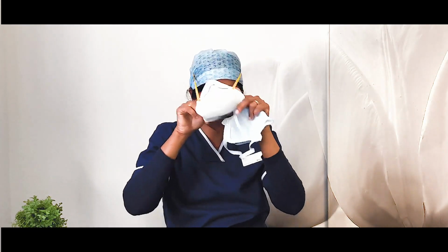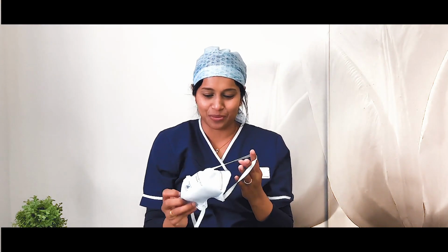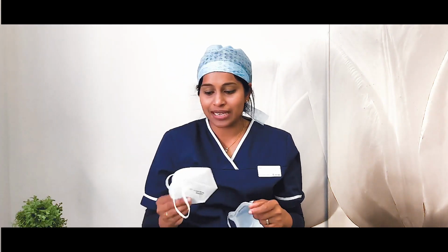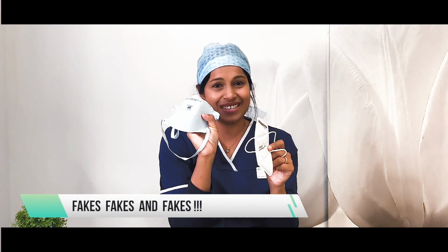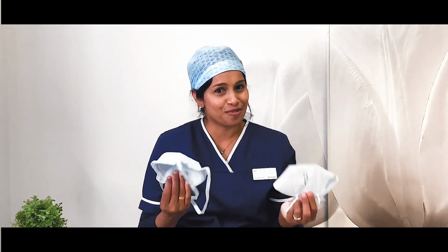So something else that I noticed is that one of the practices that we work at got an FFP2, but it didn't have any of the markings that you should really be seeing with regard to masks. Otherwise, you have to figure out a fake one. So it should have a NIOSH number. So I will be putting a description of all the numbers that are needed on your mask to see if they are not fake, because having non-fake ones which are tested is so important, because these are to protect us from getting the COVID, which is actually a killer.